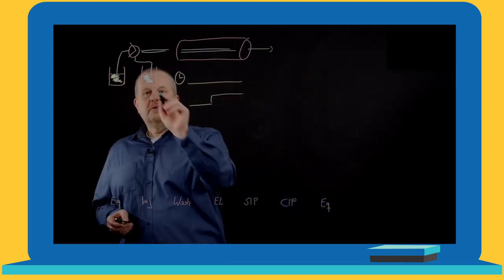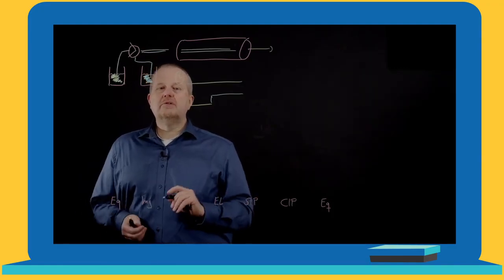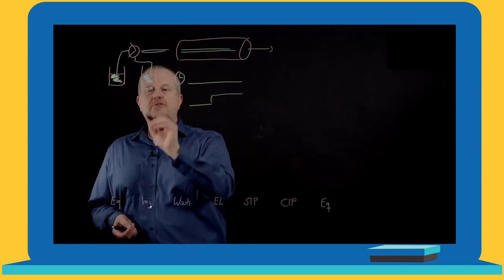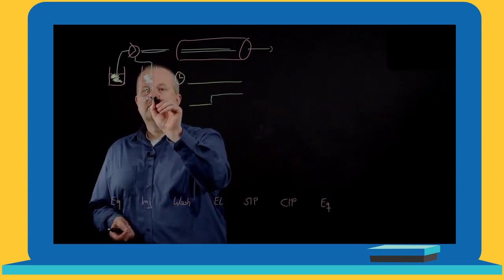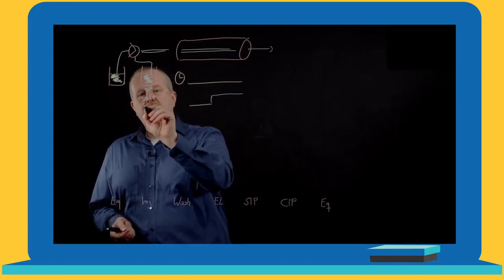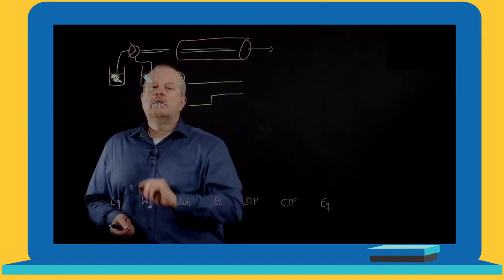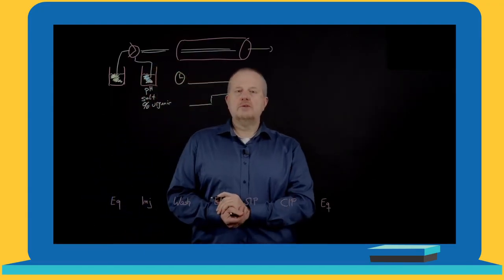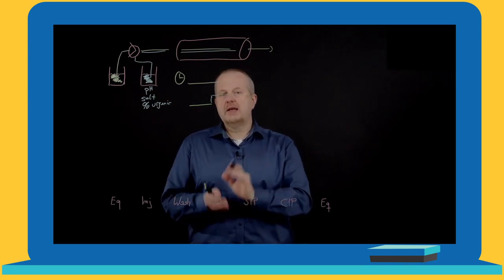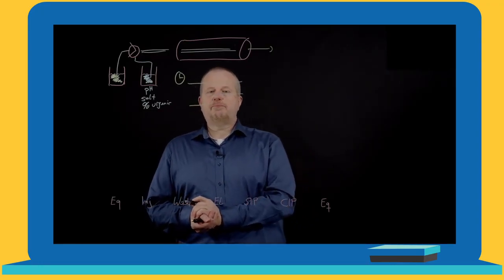What is different in the second solvent, that can be different parameters. It can be a different pH. It can be a different salt concentration. It can be a difference in percent of organic modifier. Typically, what is used is something which gives you an adjusted desorption of your compounds of interest.